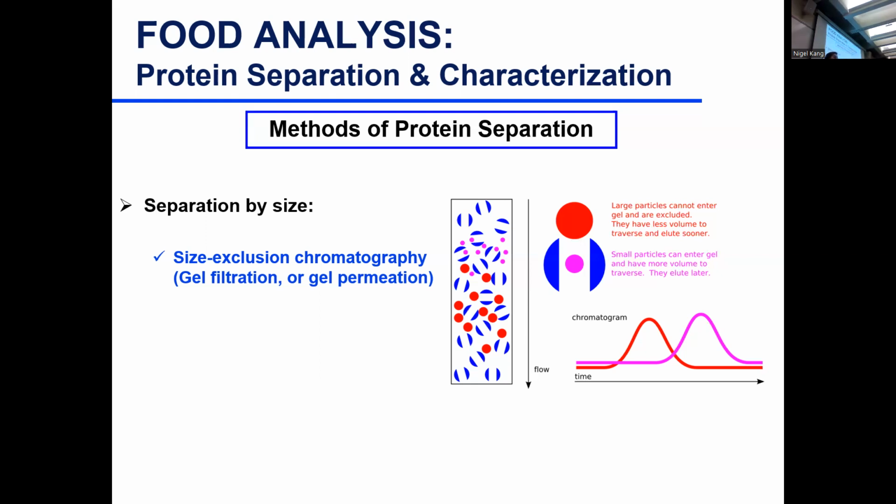Then from the largest size to the smallest size, we have different pores. So first, imagine this is our column. This is the pore size.